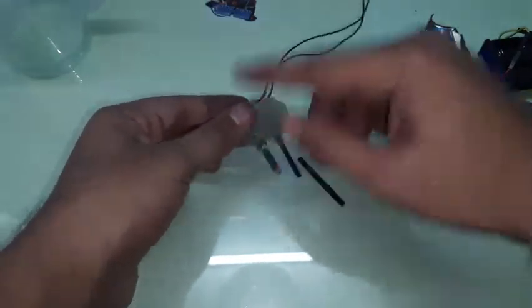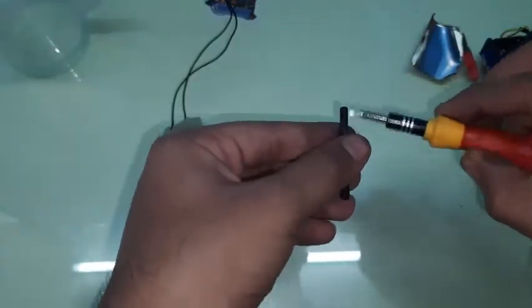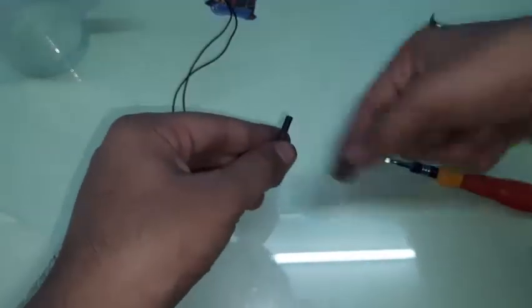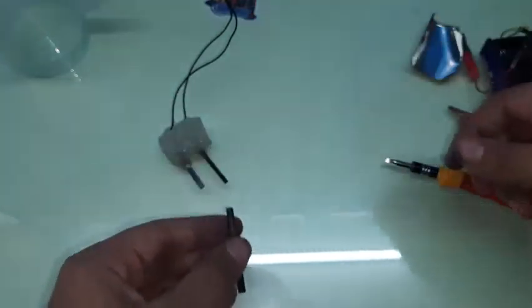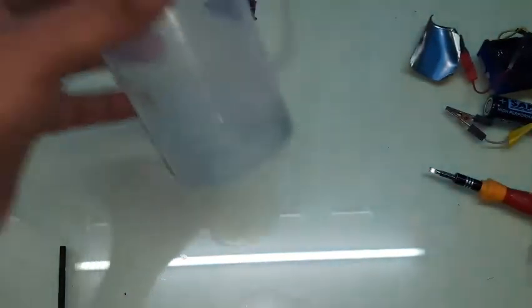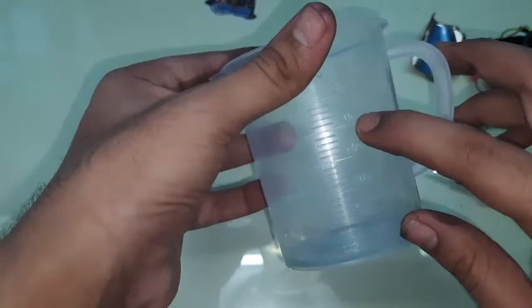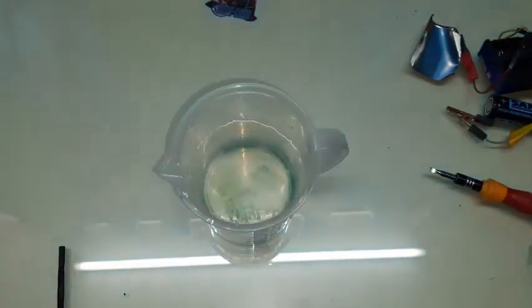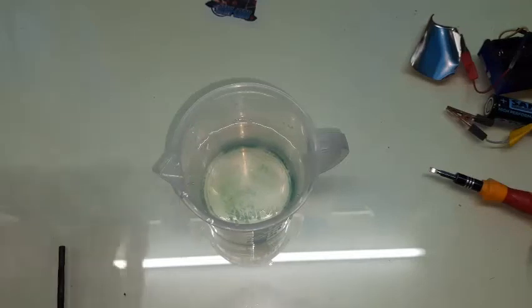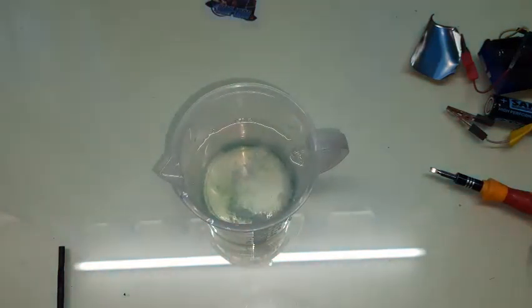To assemble the electrode holder, I placed the carbon rods into a mold I made myself — I'll put another video on how to make it. I scraped part of the electrode surface, soldered wires to them, and pulled the wires out. Then I filled the mold with hot glue. The hot glue makes the electrode float so that only the carbon tip is submerged, not the wire connection.